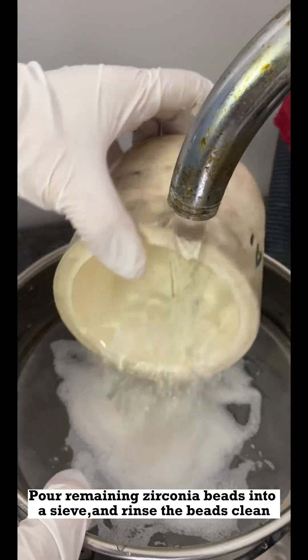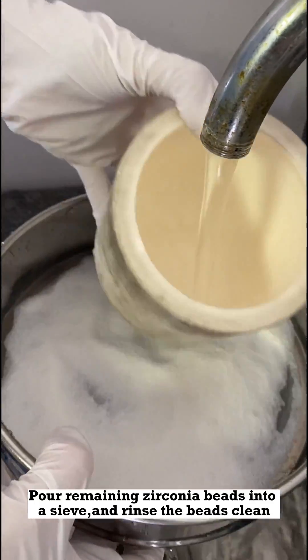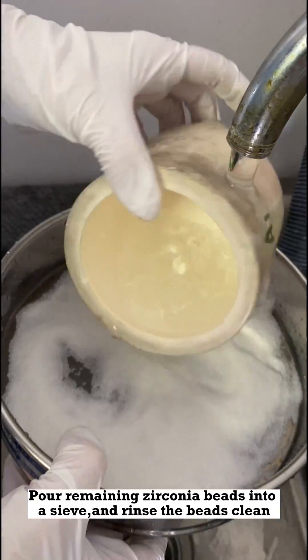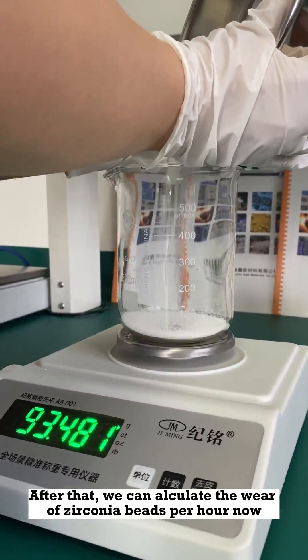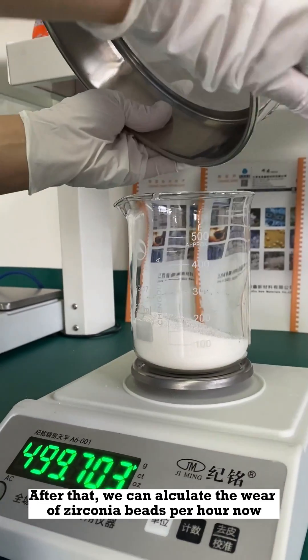Pour the remaining zirconia beads into a sieve and rinse the beads clean. Then dry the beads in the dryer. After that, we can calculate the wear of the zirconia beads per hour.